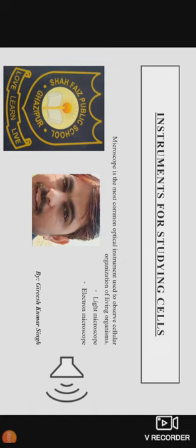So we can say microscope is the most common optical instrument used to observe cellular organization of living organisms. There are many different kinds of microscopes which can be broadly divided into two categories. The first is the light microscope and second is the electron microscope.